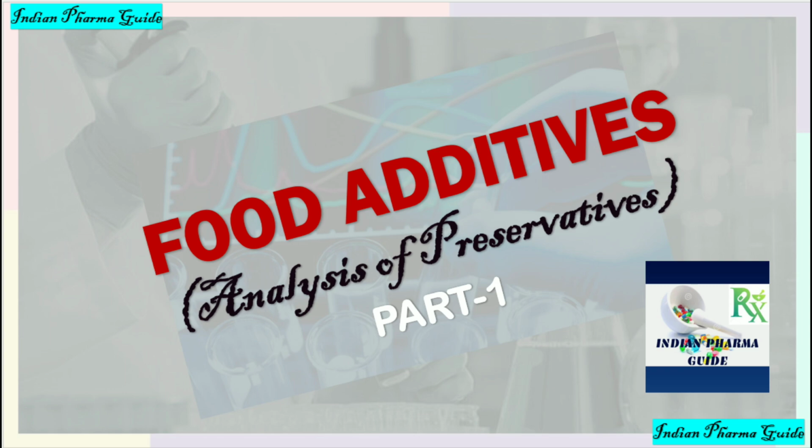In our last video, we discussed the basic introduction of food additives. So we already know analysis of the preservatives in food additives is a huge topic. So that's why I divided analysis of preservatives into two parts. So today I am going to explain to you about the analysis of preservatives part 1. Part 1 contains the basic introduction of the preservatives, classification and benzoic acid analysis.